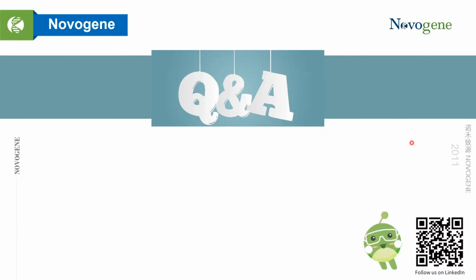And the last question is going to be this one. We had an audience member ask: does the DNA sample for genome survey and de novo assembly have to be derived from the same individual, since genomic DNA samples are required for next generation sequencing, while for third generation sequencing, high molecular weight DNA samples are requested? Right, so theoretically, yes. The DNA samples for the genome survey and for de novo sequencing have to be extracted from the same individual.